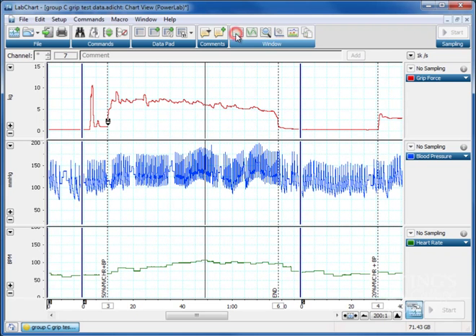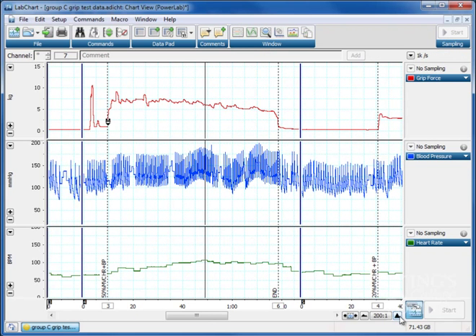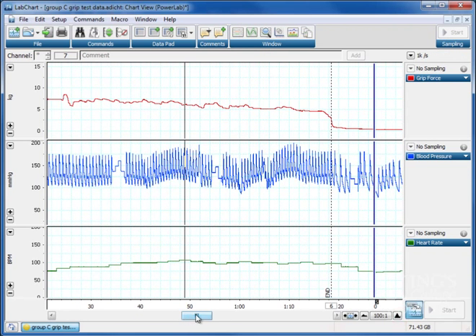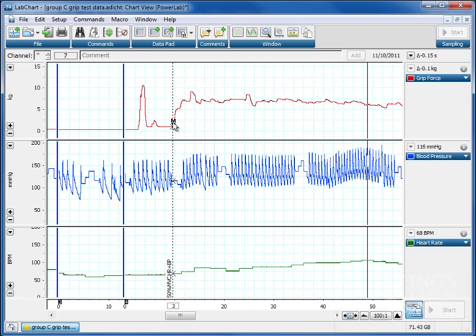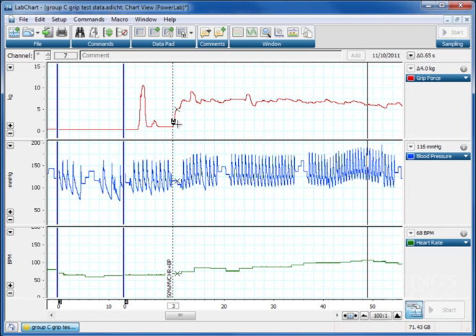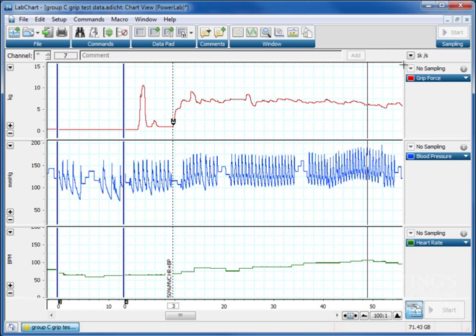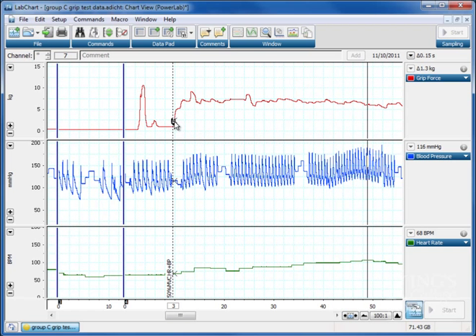So let's go back to our chart and let's think about now doing this analysis. We can zoom in and we can highlight various things and select various things. At the moment, the little M is dropped on this channel, which is the grip force. So what we're going to see in this window is grip force in relation to the M. Just as we're seeing time as a factor of M, we're also seeing the grip force increase. So it's a change in grip force. So depending where you drop the M, you'll see that over here in the window you see numbers appearing.